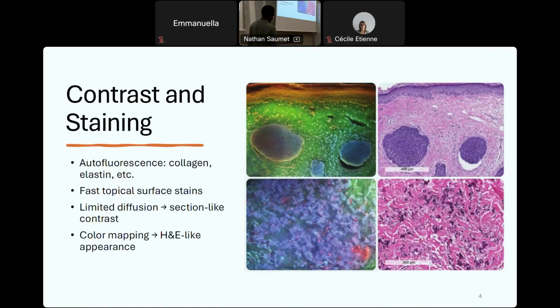In the two bottom pictures, we can see that on the left picture there is a red part that doesn't have any equivalent on the right part. So in your opinion, do you think that MUSE can allow us to better distinguish different types of cells?